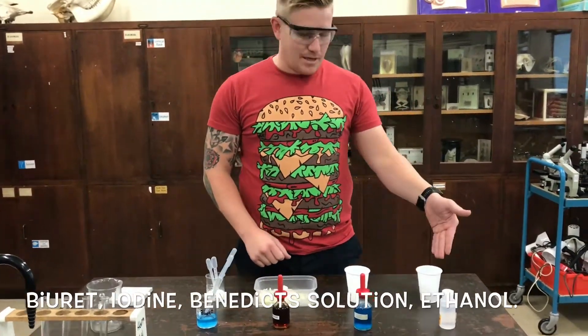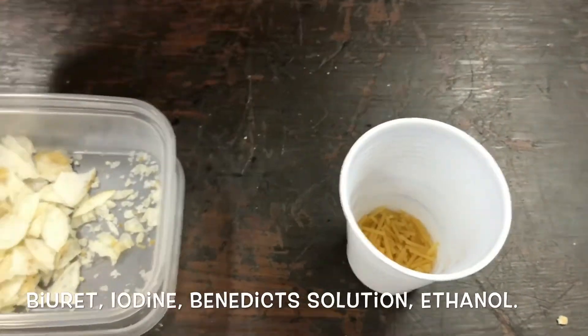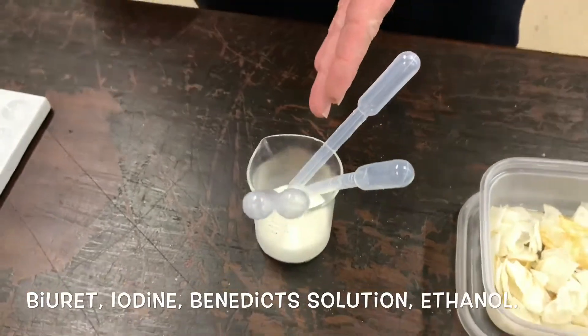We're going to test some biscuits, some pasta, some crisps, and some milk today in our food tests.